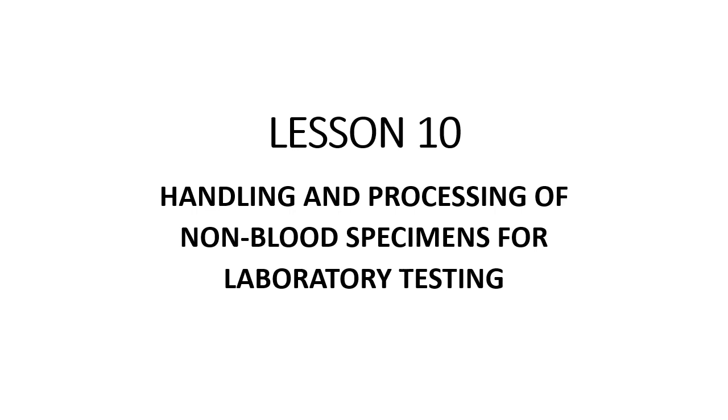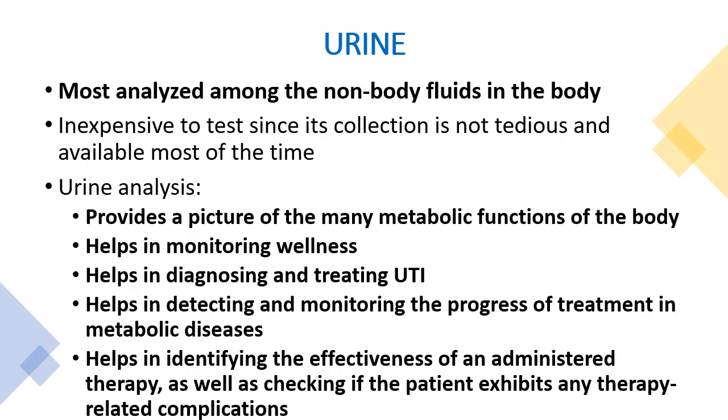Good afternoon, everyone. So we'll be discussing today lesson number 10, handling and processing of non-blood specimens for laboratory testing. So the previous lesson, it's for blood specimens. Ito naman is for non-blood specimens. So let's proceed. So first, ano yung non-blood specimen?